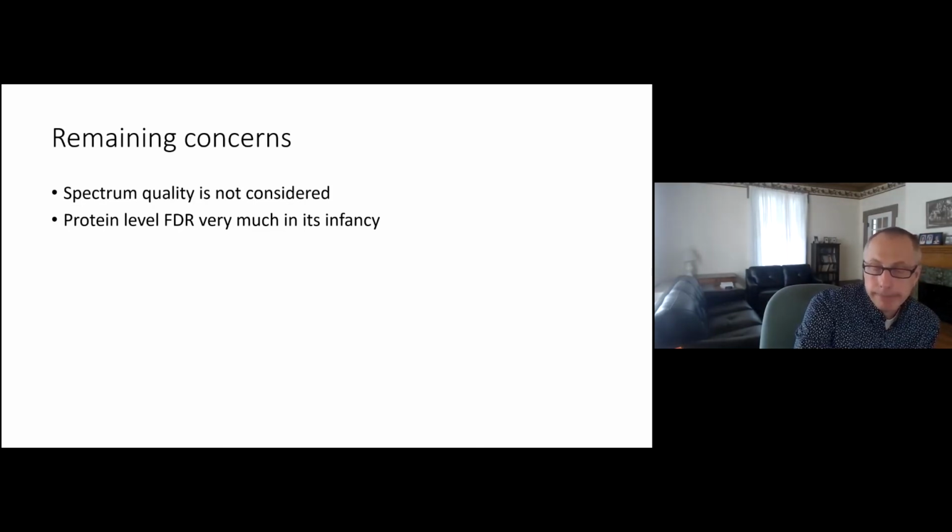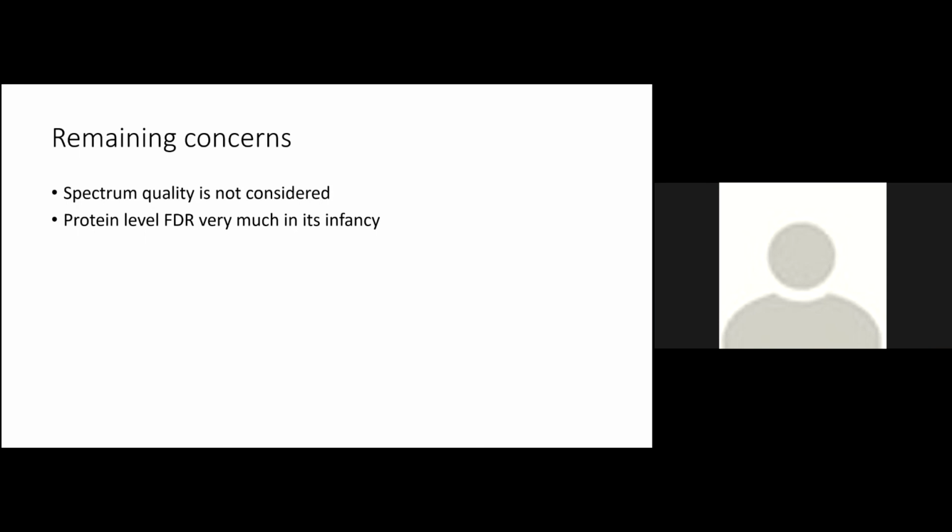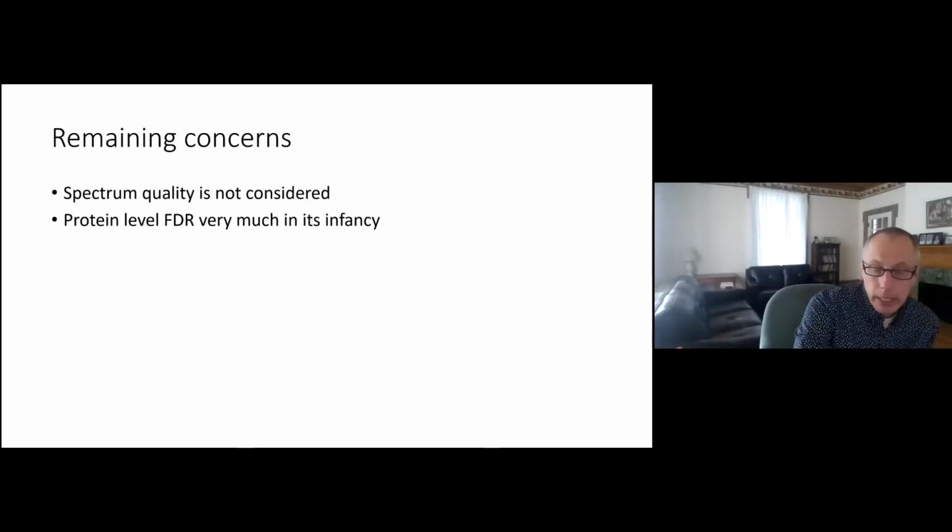Okay, I just sort of feel like that allows for more accuracy. You know, when you don't, as I mentioned early in the talk, if your database is incomplete or doesn't match your sample, then all you can get are false positives or decoys, right? We're going to report the best match for every spectrum. And if the spectrum doesn't have its correct match as a possibility, it's going to match something else, and that's going to get reported. So including protein isoforms in the search provides an opportunity to get a correct match for some things that you would otherwise not be able to.